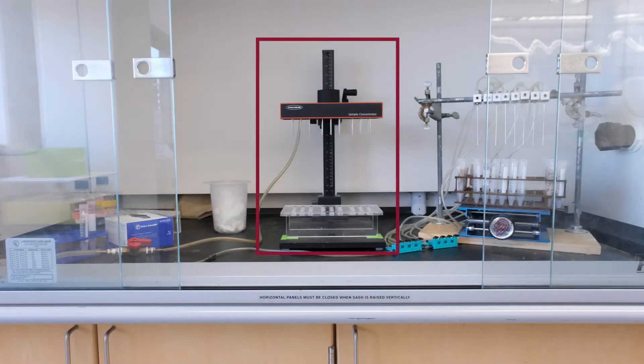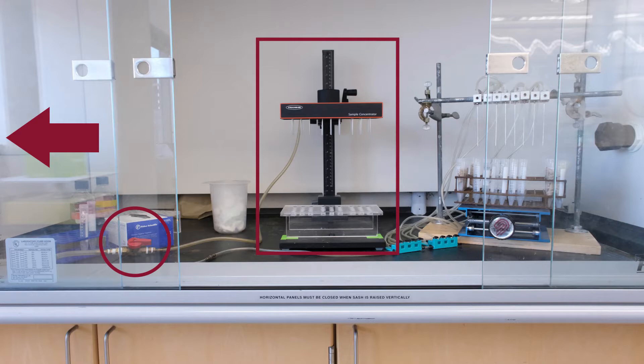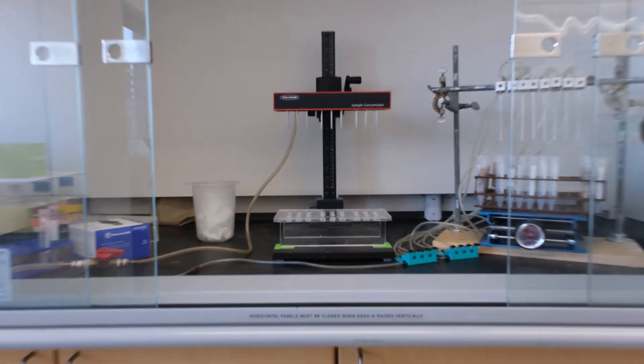This is the 36-slot sample concentrator. The nitrogen tank located next to the hood is attached to the sample concentrator by tubing, controlled by this red valve. Make sure that the valve is open, where the handle is parallel to your tubing, before starting gas flow.